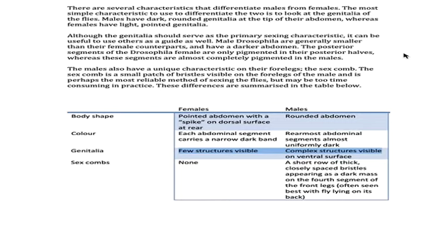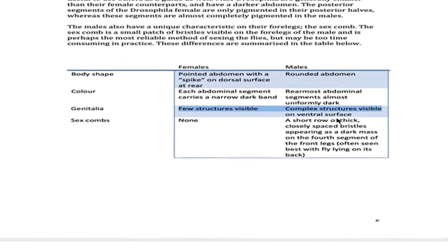So the females have a pointed abdomen with a spike on the top side or dorsal surface near the rear, whereas males usually have a much darker rounded abdomen. Those are really the strongly identifying features. Once you get a dissecting microscope, you can additionally see some structures around their genitalia, particularly whether there's a lot of stuff or a little stuff. Males have more stuff on the ventral surface of their abdomen, and females have fewer structures externally, more of them are internal.